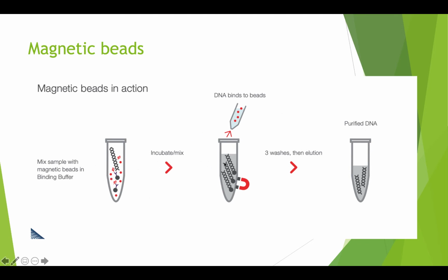Once you incubate, you do that, and then you wash the DNA 3 times, and then you elute, and then you have your purified DNA.